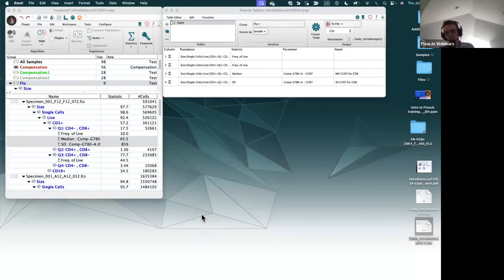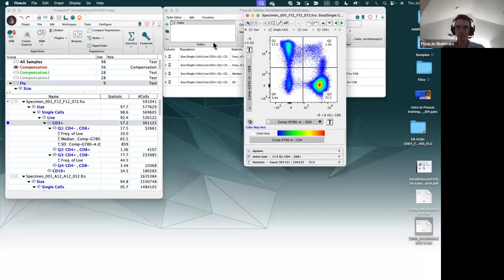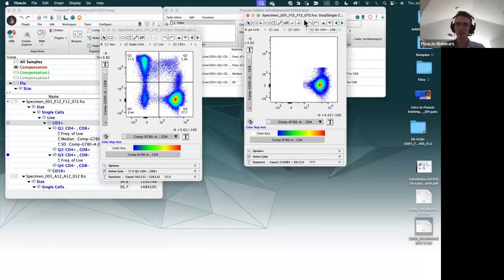Oh, there's a question about when you'd use median versus geometric mean for the MFI for flow cytometry data. It's a good question. People will use both, is the short answer. Both are pretty common. Both are pretty accepted. They're just different ways of describing the central tendency. And so just to look at some Gaussian curves real fast of the positive population here, for instance.